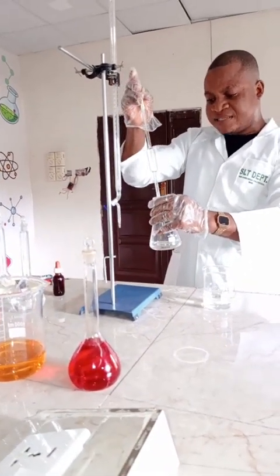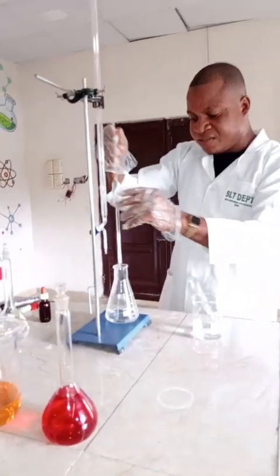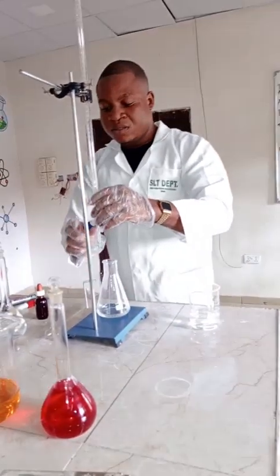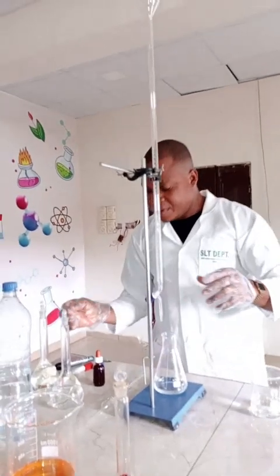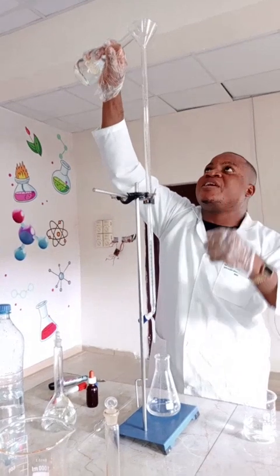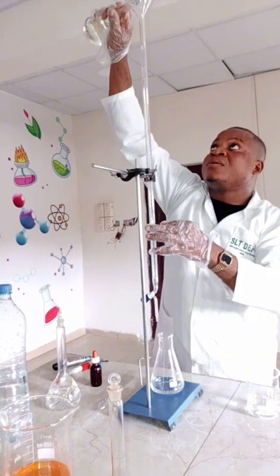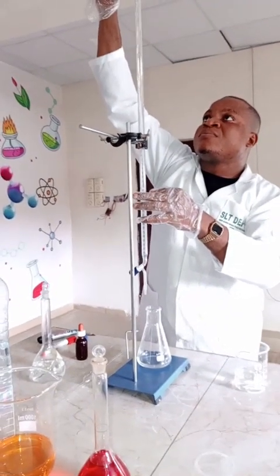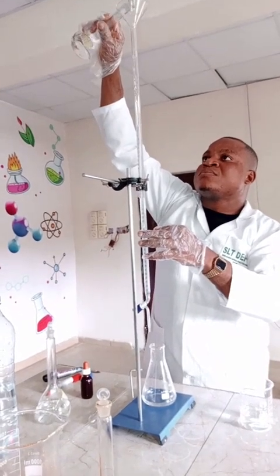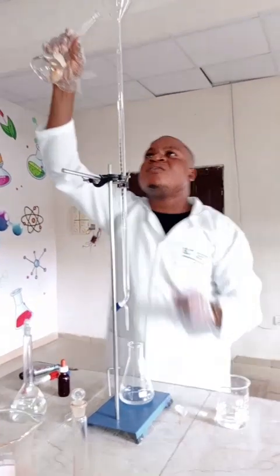This is my titrating flask, the conical flask. I've pipetted 25 ml of the base. I'm going to tighten my tap while I introduce my acid with the aid of the funnel into the burette. I want to make sure this is at the 0 mark of the burette.